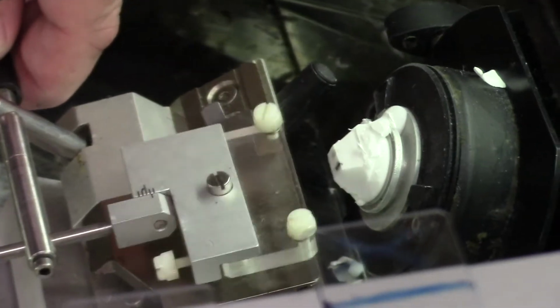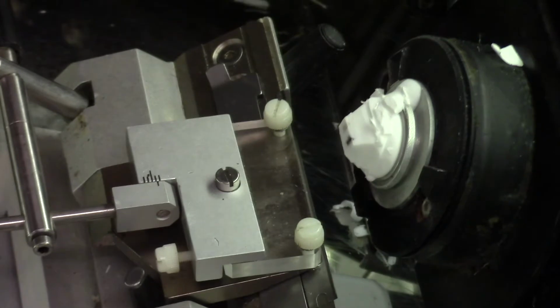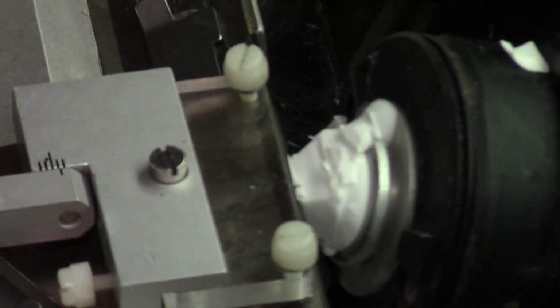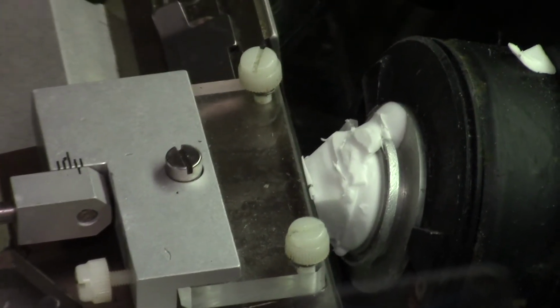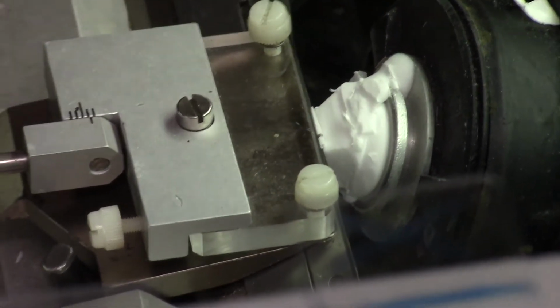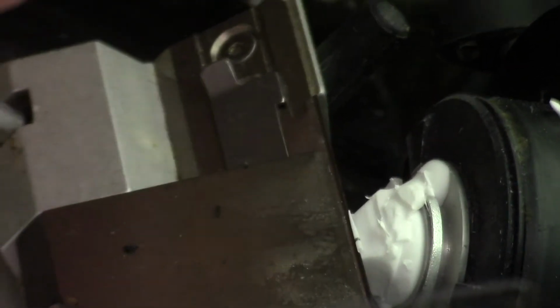So I'm going to put the roll guard down, and let's see what we can see as I much more slowly crank this block past the knife. Well, I know what happened. I bet you guys couldn't see it. The shaving of ice was blocked by the side of the glass, and it didn't go under the glass. It just got repelled, just rejected. So all it did was it just curled up right there at the front of the knife.